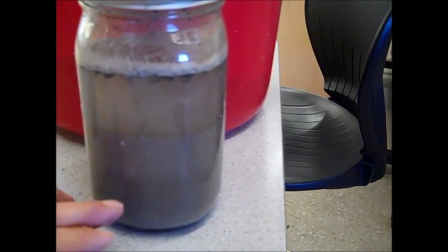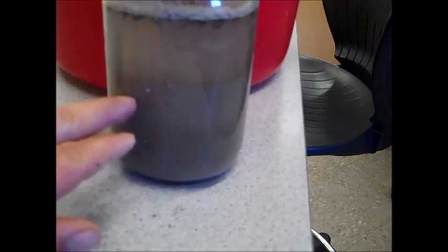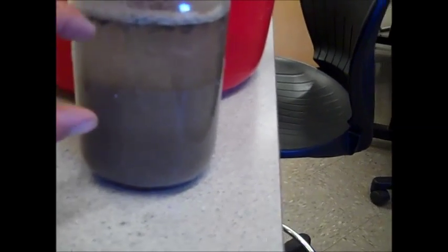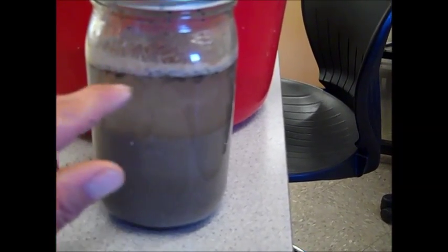Most soils have a percentage of sand, silt, and clay. Sand will be at the bottom with the biggest, grainiest size pieces. It'll feel rough and coarse in your hand. The next intermediate will be silt, and then whatever's on the top will be clay. And so you're looking at this, and then here's your water, and then any organic material that was in your soil is floating on the top.